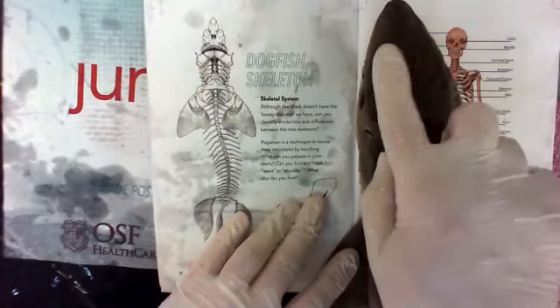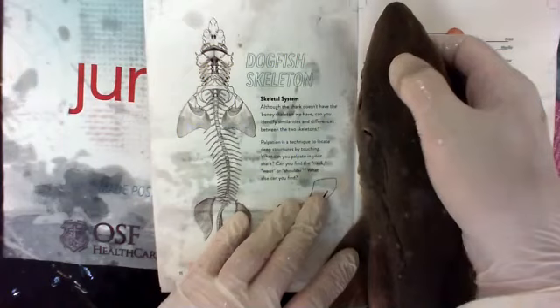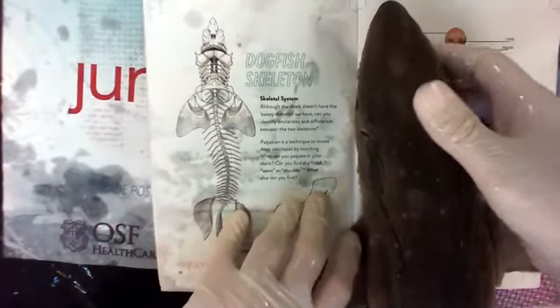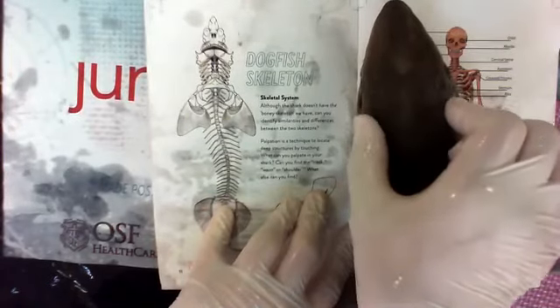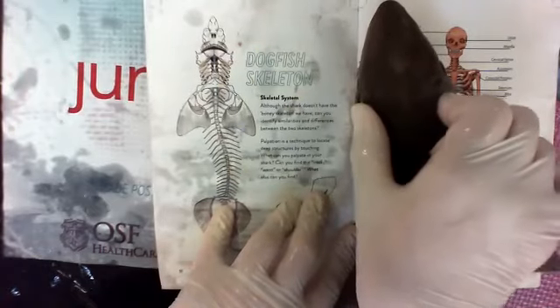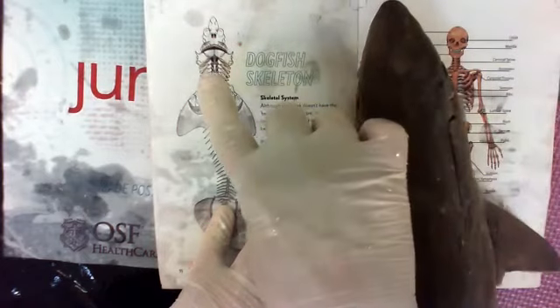It's not made out of bone like ours, so it feels dense, but if I squeezed hard, I'd crack it. Sharks aren't used to having things squeeze them, but it would crack kind of like an egg. You can feel the shape of the skull, so I can feel this part right here, right behind the eye sockets. I can feel it dropping in right through here.